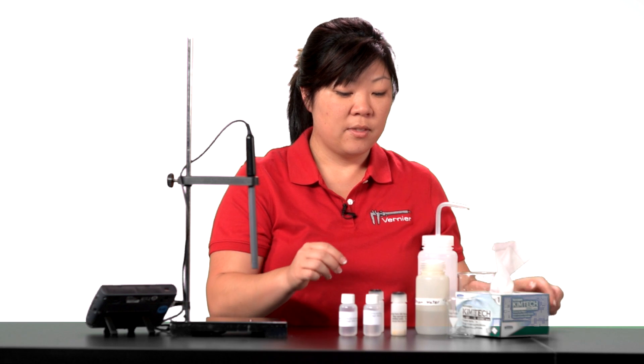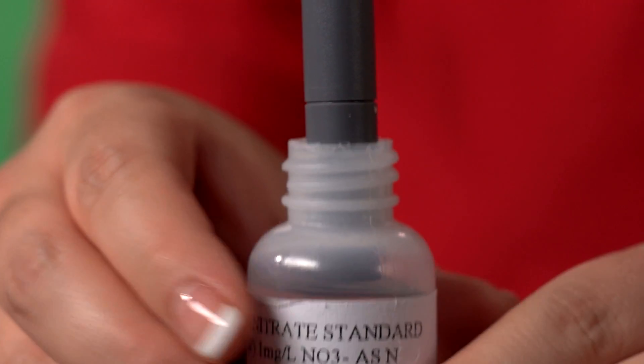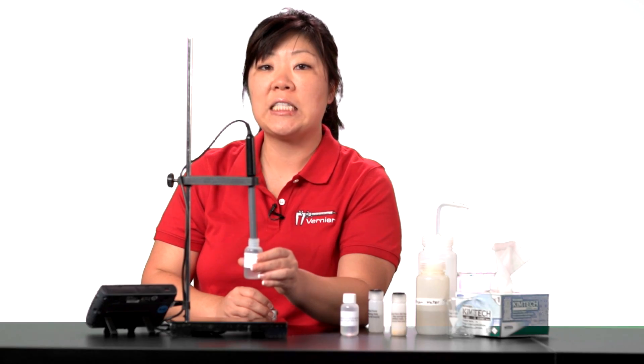Then place the tip of the electrode in the low standard. For the nitrate ISE, this is 1 milligram per liter. Make sure the tip is not touching the bottom of the container and that your small white reference contacts are immersed.